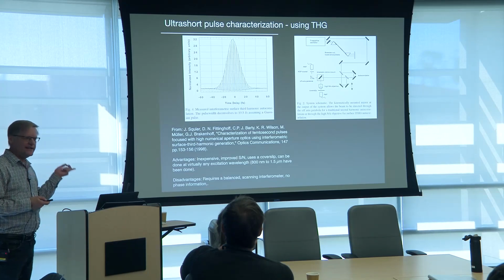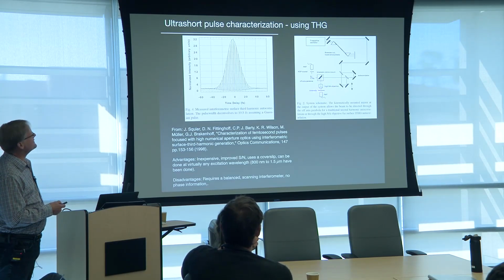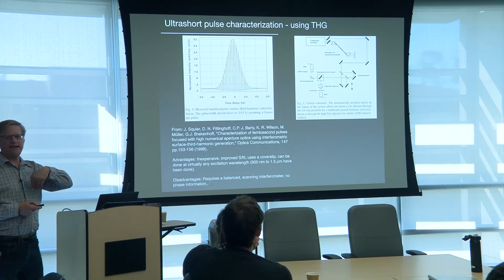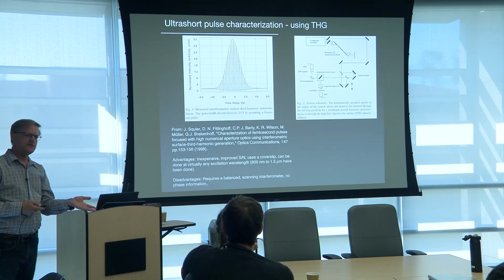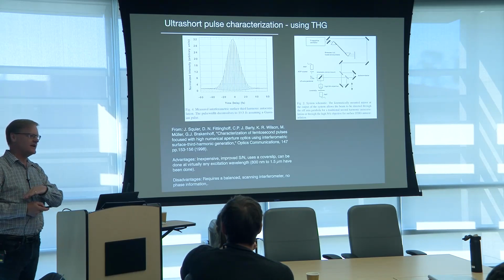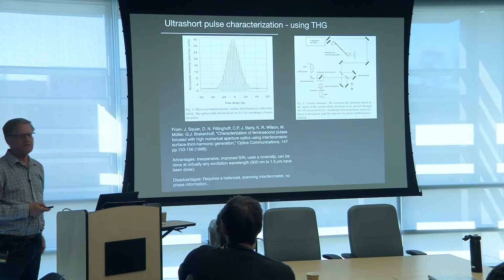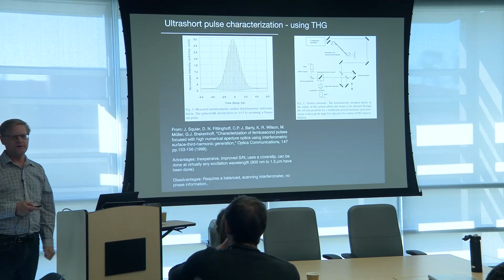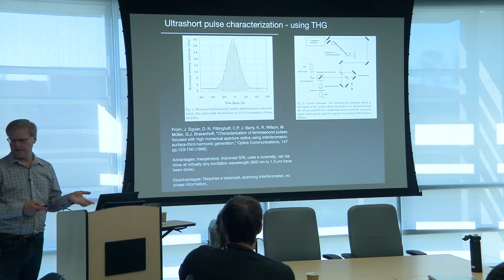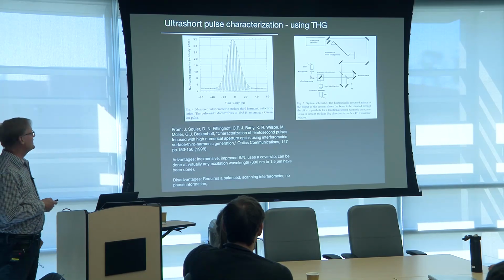And this is at 800 nanometers. So we really just have the cover slip. You focus on the back side of that cover slip. And when you go to the back side, you have a huge index change between the cover slip and the air. That means you're going to get copious amounts of third harmonic with that large delta N. And you can literally just push your PMT right up there. So even though I'm at 265, this third harmonic was no problem to detect.